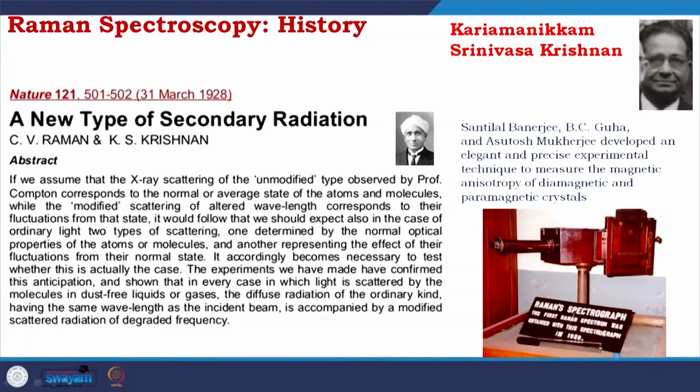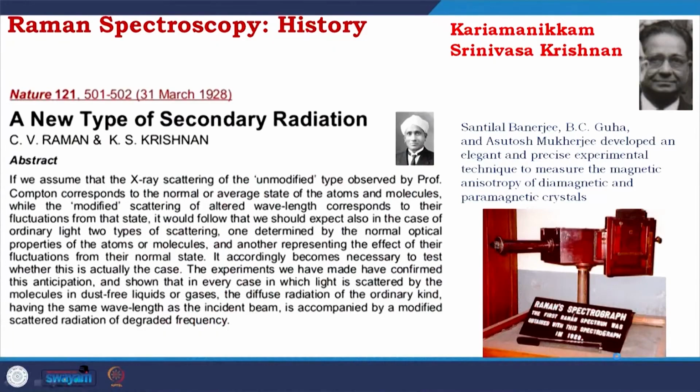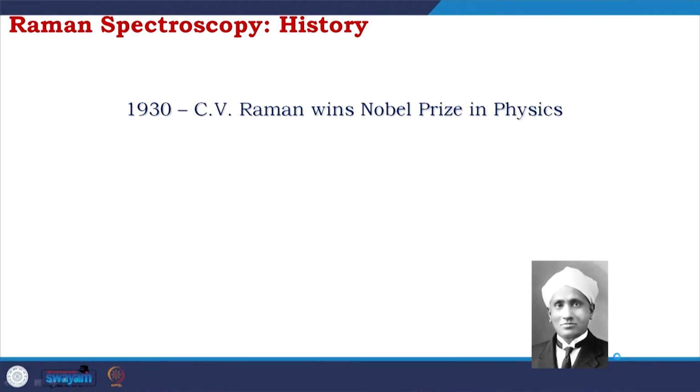So, this is a little bit about K.S. Krishnan, and this is the Raman spectrometer which we are talking about in Calcutta in the institute IACS. It is kept there as a memorial, which is the first indigenous setup of Raman's lab, who identified the spectra using this spectrograph.